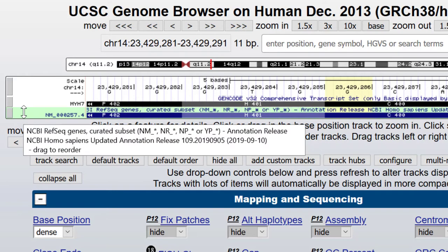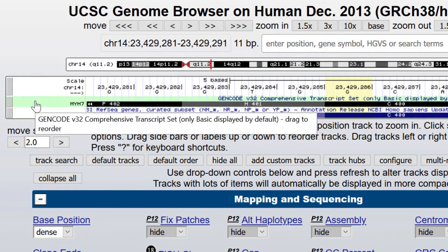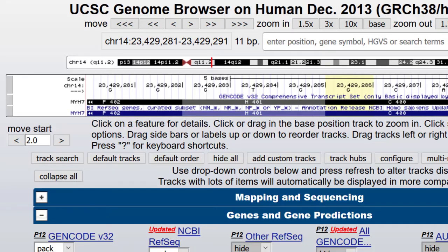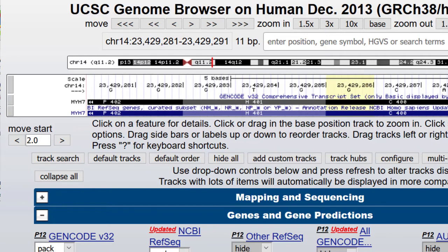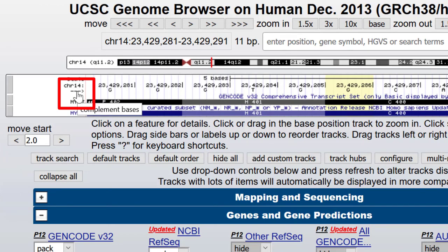Notice that the RefSeq track is turned on because the NM_underscore identifier identifies that track, so there are now two gene prediction tracks in the image. Notice that the amino acid numbering shows that the transcript is on the bottom strand reading right to left, so the highlighted genomic nucleotide is a G, not the C specified in the HGVS — which was C to T — because that is transcript-oriented. You can reverse the DNA sequence in the image by using the little arrow at the left side of the base position track at the top of the image.